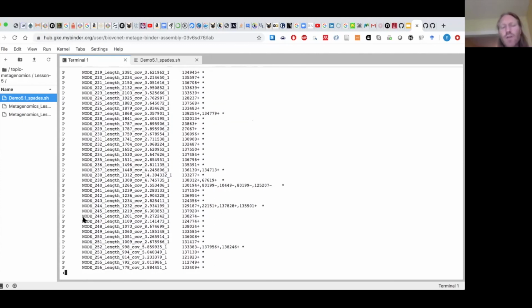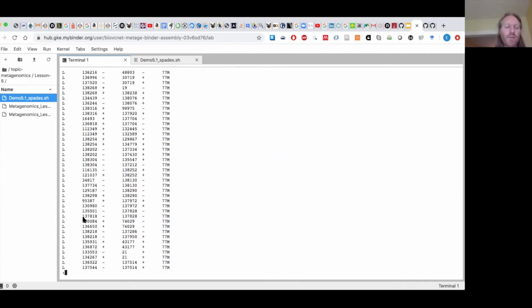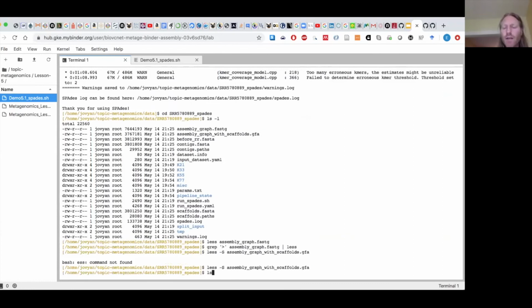There are other software packages that parse this data to reconstruct the assembly graph for visualization. The one I often use is called Bandage, but you can also import these into programs like Cytoscape or something that they may be using in the network analysis topic to do double duty and look at your assembly graphs.